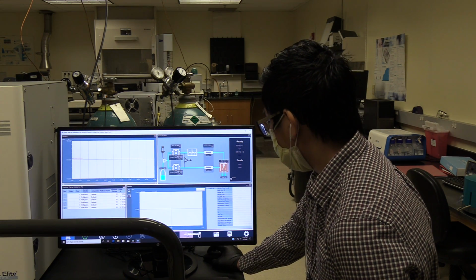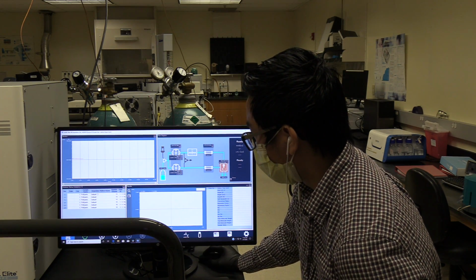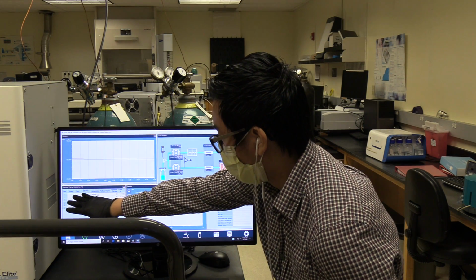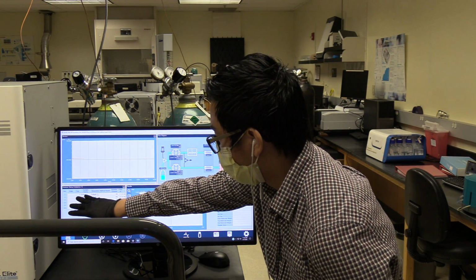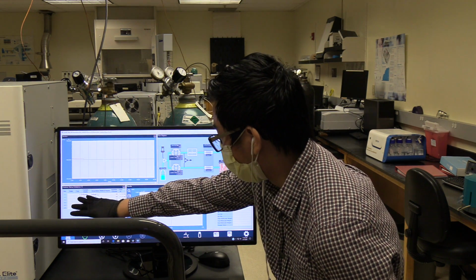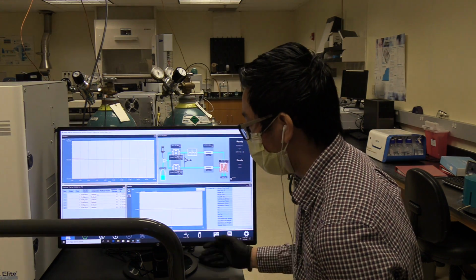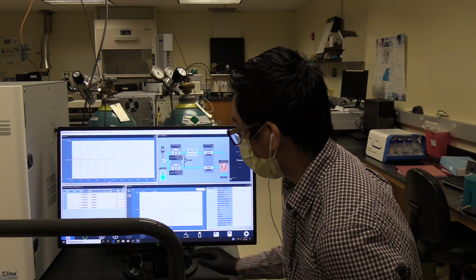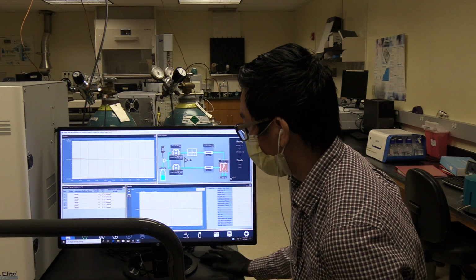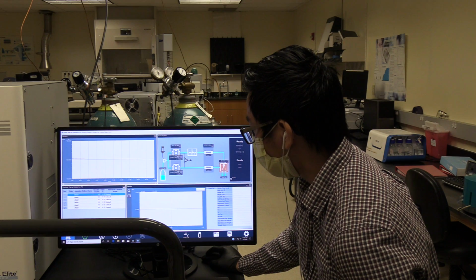Moving past acquisition, you can look at individual conditions. So in this sample sequence, you're going to see the acquisition method here. So I'm going to point here. You're going to see your state, whether or not it's been analyzed or not. In this sequence, you're going to see a cup. So cup is also going to be your vial number. So we're injecting from vial cup 1. The name of your sample, the acquisition method, which we just talked about, the injection volume, the number of times you would like to inject from that sample cup. In this case, we can only do 3 per line.